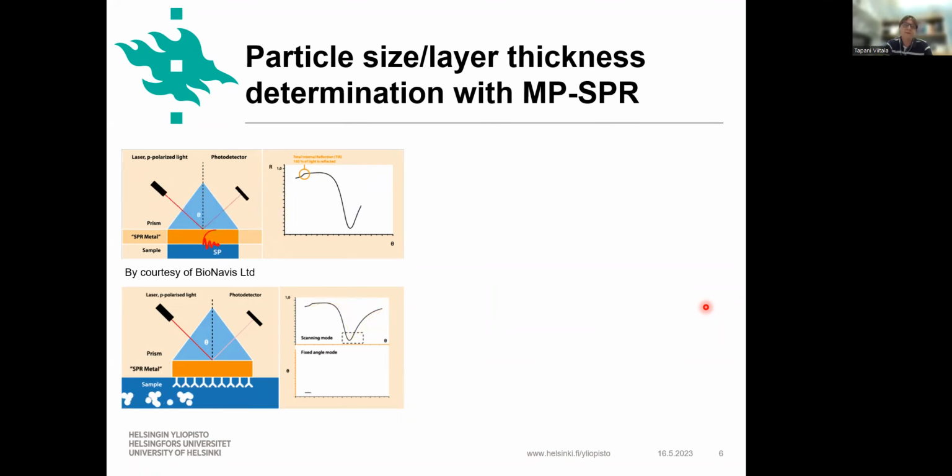Basically, what we measure in its simplicity with this SPR is the refractive index change on the surface near the sensor. That is quite an understandable concept, because all materials have a refractive index. If we have a baseline starting without anything on the surface, and then we inject something and something is absorbed on the surface, we get a refractive index change because the material increases there at the interface. That is in its simplicity what we measure. So if you want a take-home message of what we are measuring with SPR, it is changes in refractive index.